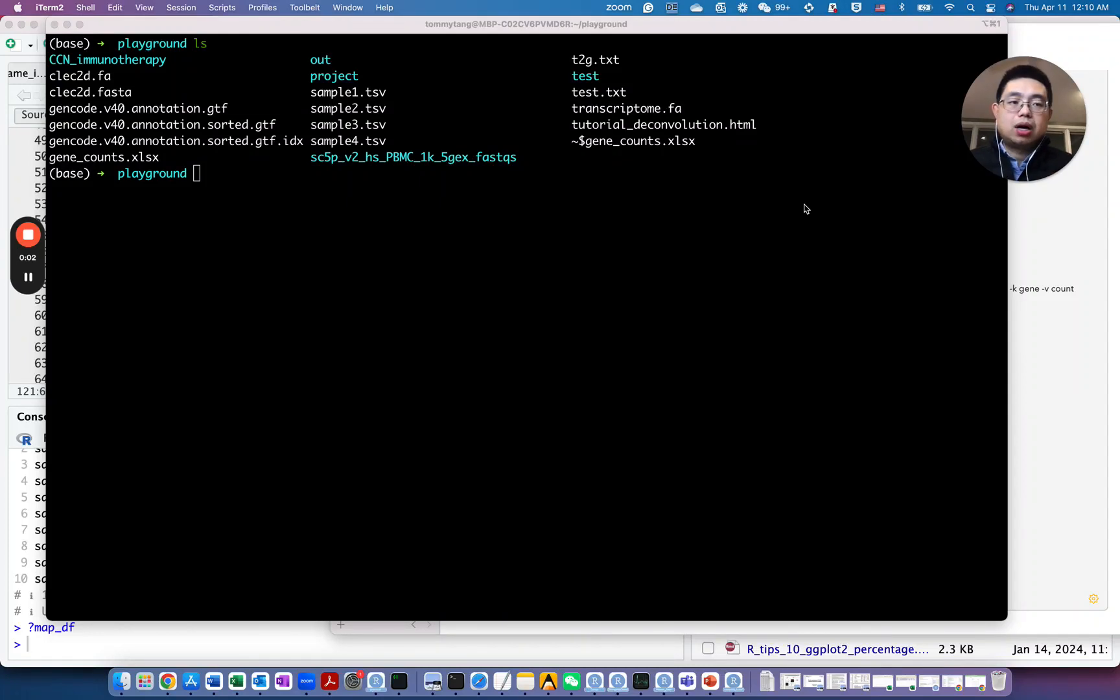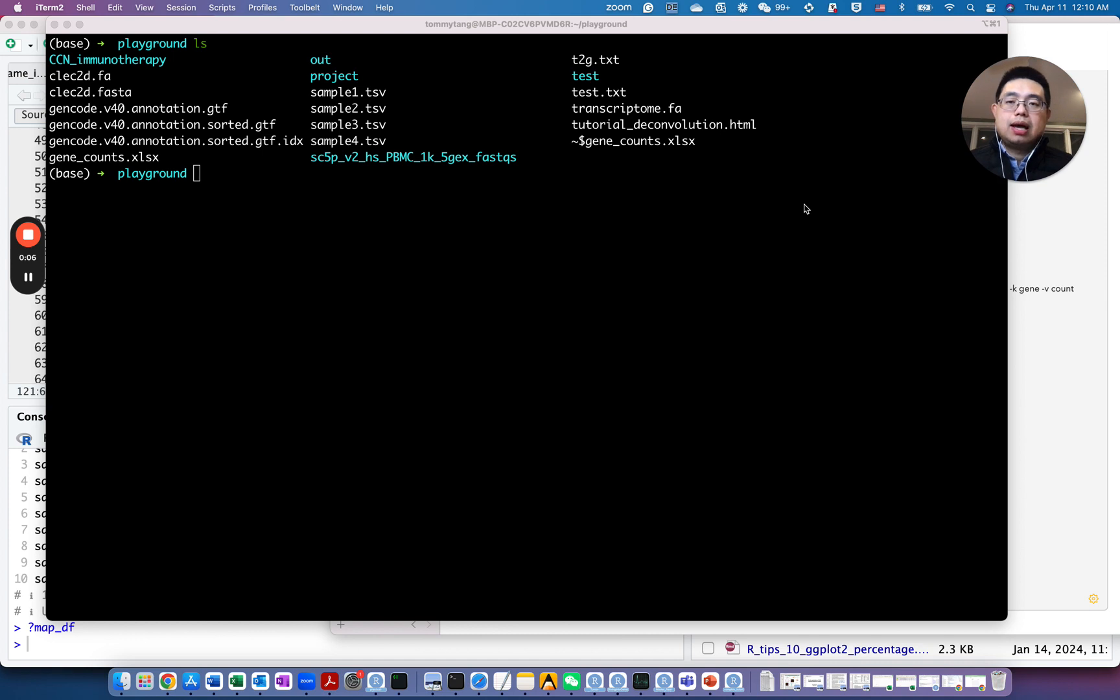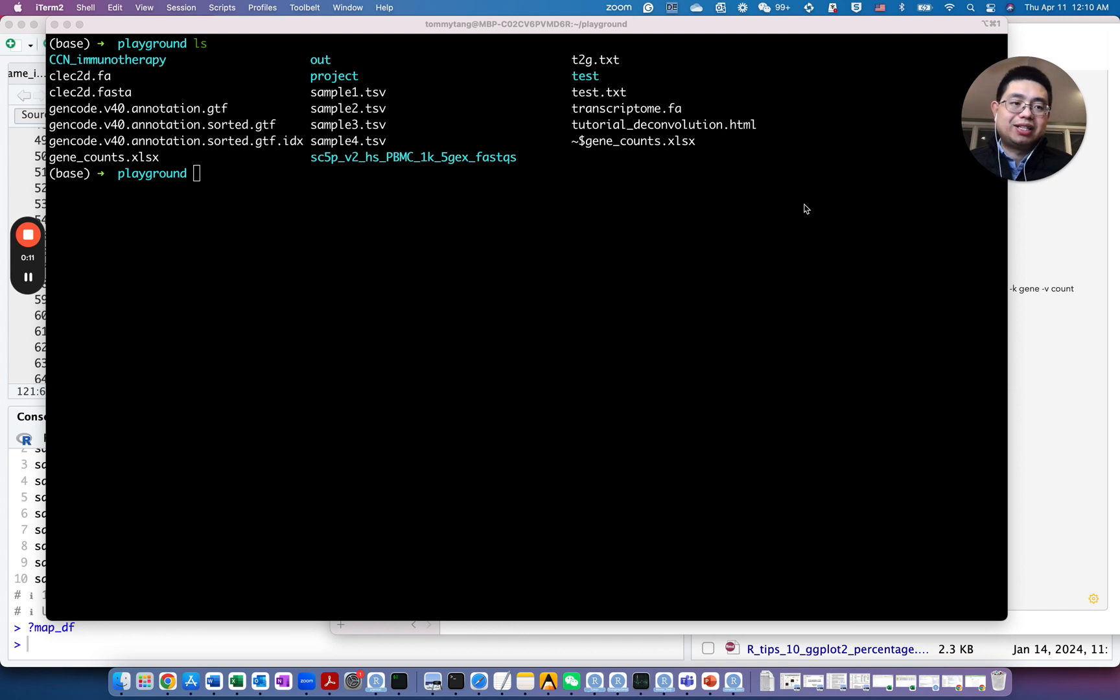Hello, this is Tommy. Welcome back to ChatLamix. So in today's video, I'm going to show you how to combine multiple counts files into a single file using Unix commands.